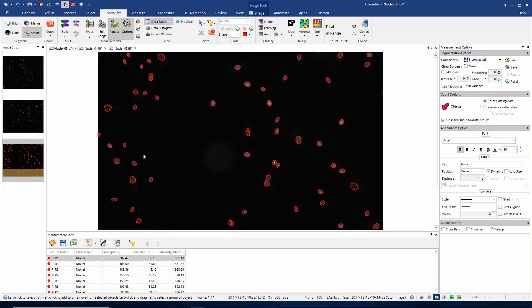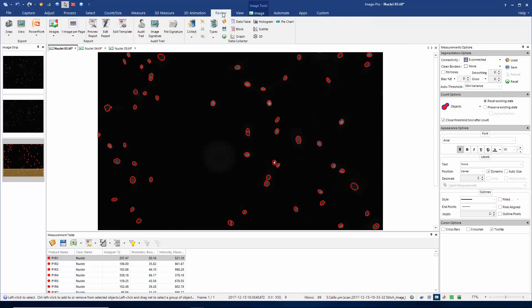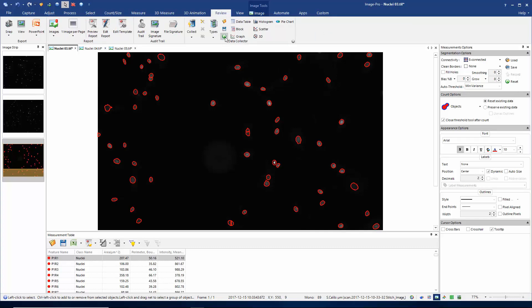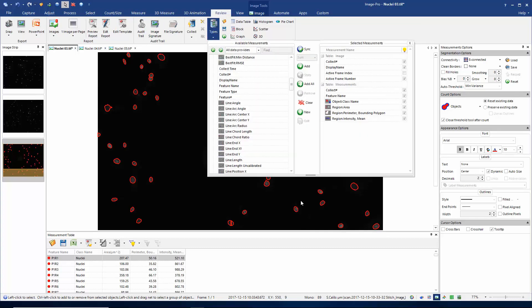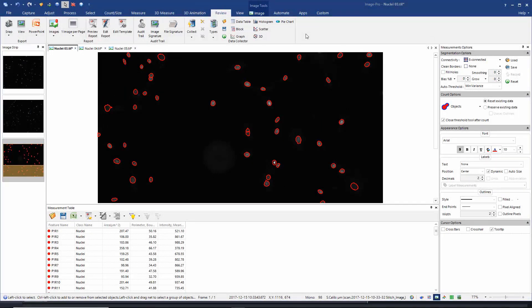Now that I have these measurements executed on my image, I can go back to my review tab and hit 'reset measurements list.' Now if I look at my types, you'll see that the data collector has become synchronized with my measurements table, and I'm now going to automatically measure area, perimeter, and mean intensity of each object.